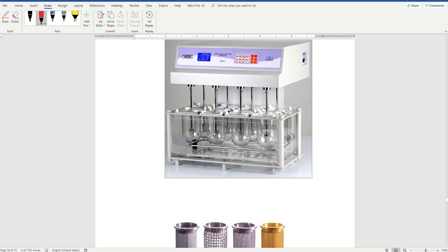Wait until the temperature is 37 degrees Celsius. Yeah, the temperature of the media inside the vessel should be 37 degrees Celsius. So it is the same or similar خلينا نحكي to the disintegrating apparatus. برضو الميديا has to be 37.